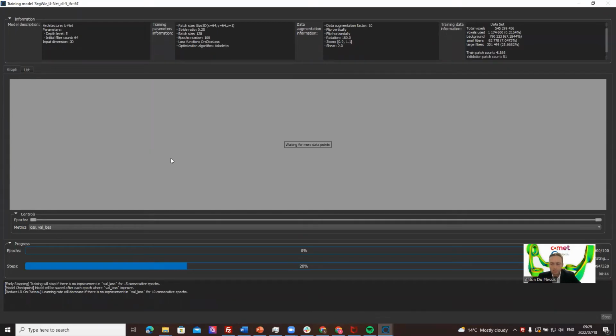So the idea here is to show you how to add data and to label the pixels clearly in Segmentation Wizard. And basically you have all the 2D segmentation tools available. I've only shown you the brush, the full brush and the Otsu brush, lower and upper. And also right click to add unlabeled voxels to class.